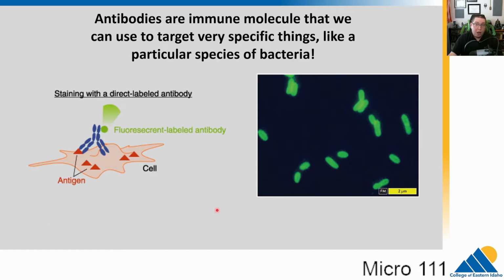Okay, this was all possible because of fluorescent microscopy. And fluorescence is a special type of light. When we shine a light on something, if it gives off light at a specific wavelength, we call that fluorescing. For our purposes, just think about it as glowing.